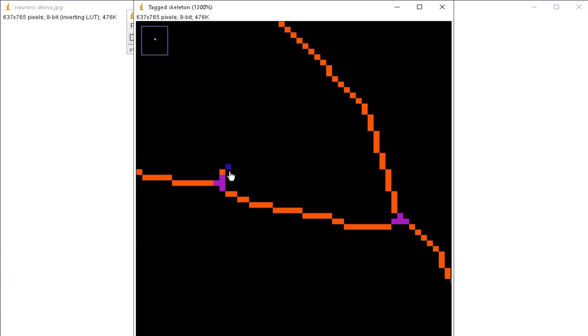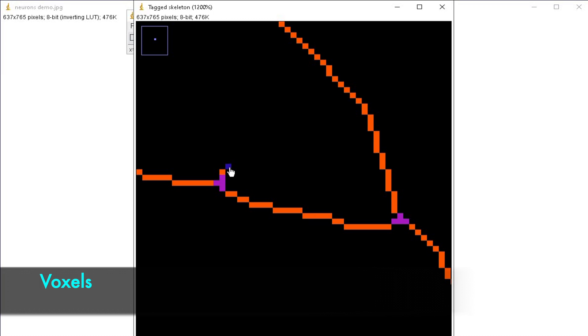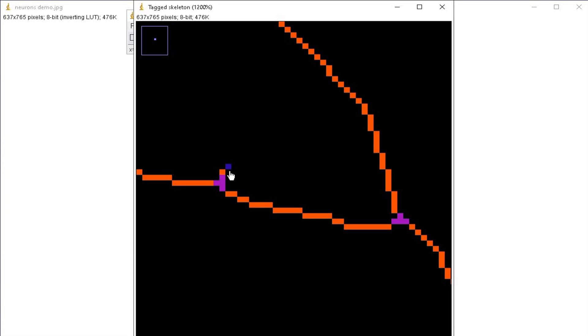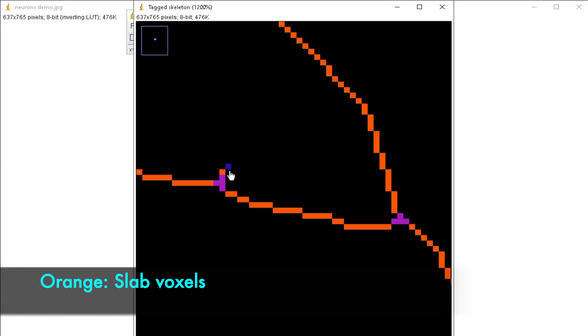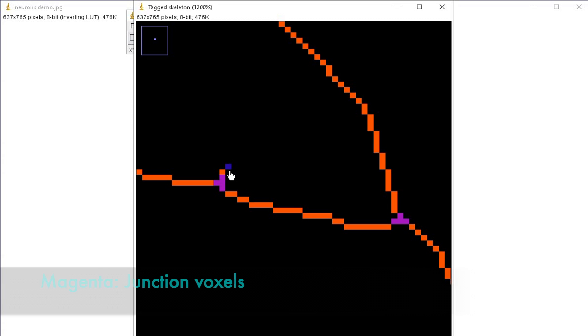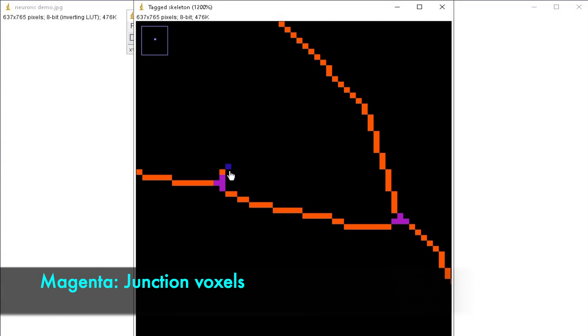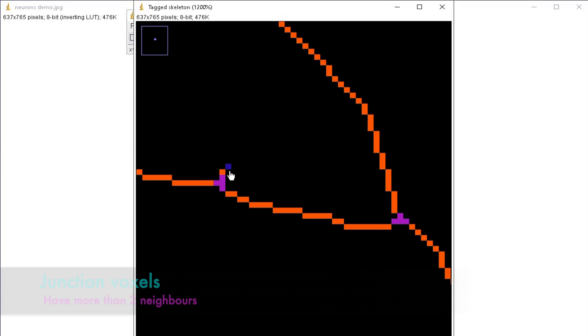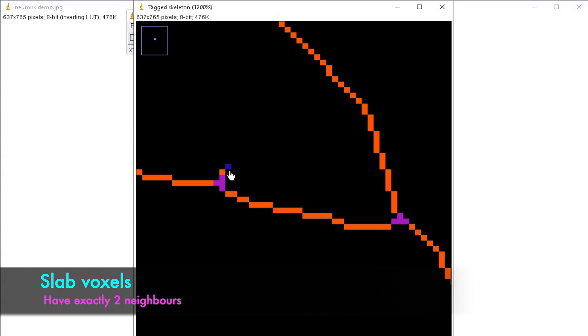These branches are referred to as voxels. Endpoint voxels are displayed in blue, slab voxels in orange, and junction voxels in magenta. Endpoint voxels, indicated in blue, are the ones that have less than two neighbors. Junction voxels in magenta have more than two neighbors. Slab voxels in orange have exactly two neighbors.